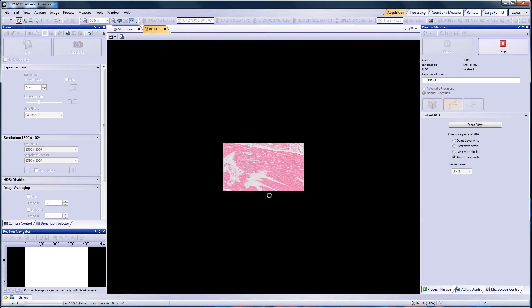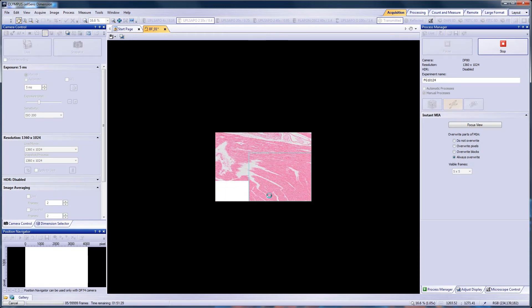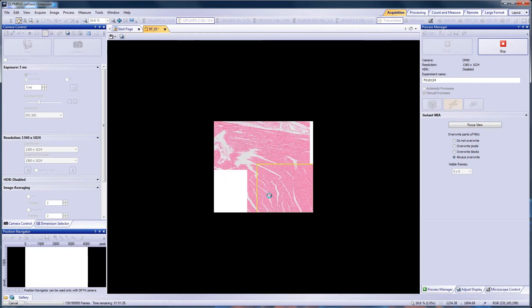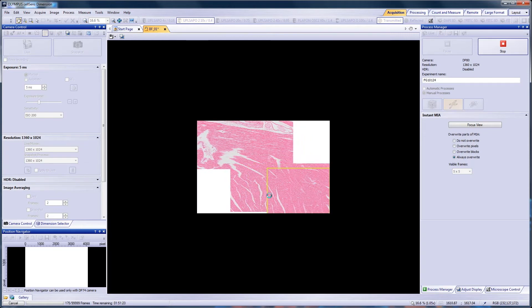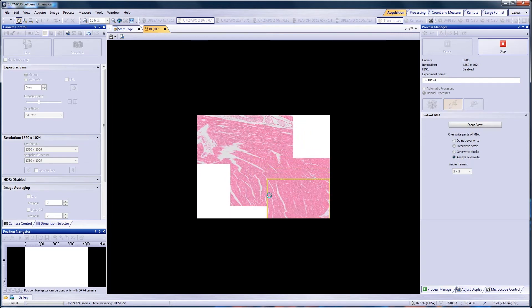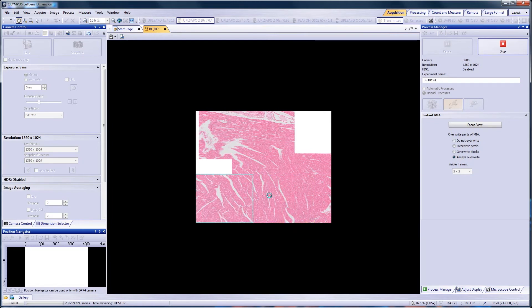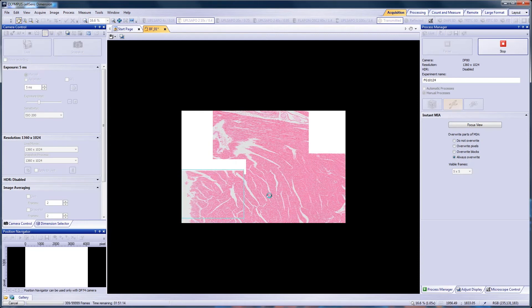As you move around your sample, the software will build a stitched image in real time. If you notice errors, simply move over these areas again to rewrite them according to your overwrite settings.